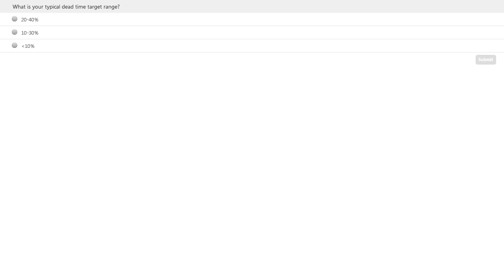And of course, this is likely detector dependent as well. With the SiLi detectors, there is a good reason to work at the 20 to 40%. And as we sped up to the SDDs, good reason to work in the 10 to 30. And if there are any brand new EDAX detector users out there, you probably may have already discovered just how quickly and efficiently your detector can work, and you might be working at that 10% or less.